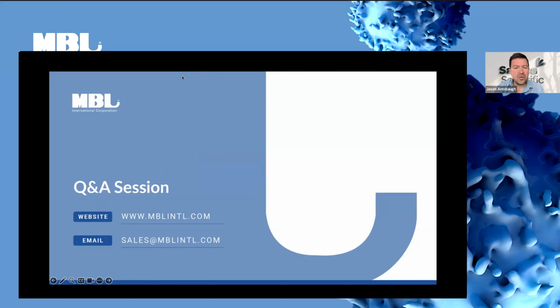Perfect. I've got one more question in the queue. So audience members, if you have other questions, please ask them now. The question I have is, could this method be used to validate neoantigen in silico prediction tools? Absolutely. And for that, if all you care about is validating whether or not a peptide binds to a particular MHC, maybe don't get the tetramer. We have a monomer kit. It's basically just the MHC molecule, and you can do that. You don't need to stain cells with it. It's going to be more cost effective to do it that way.